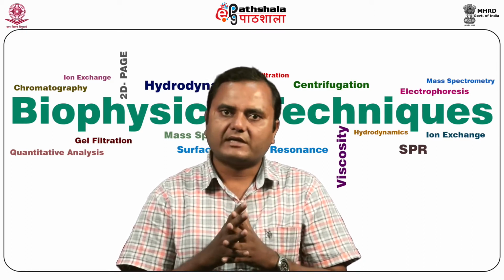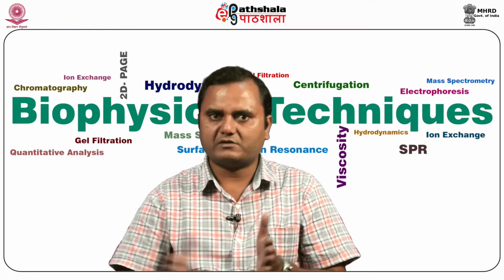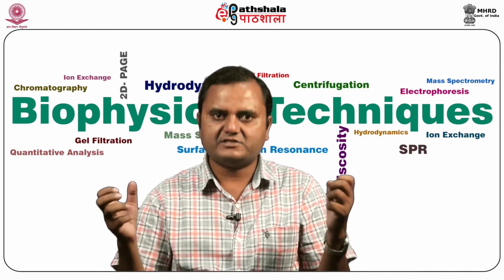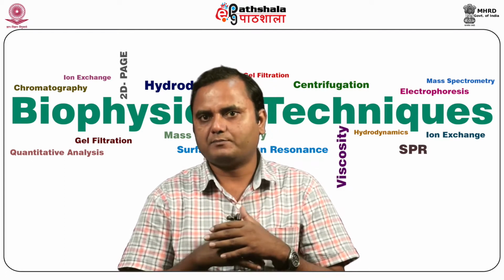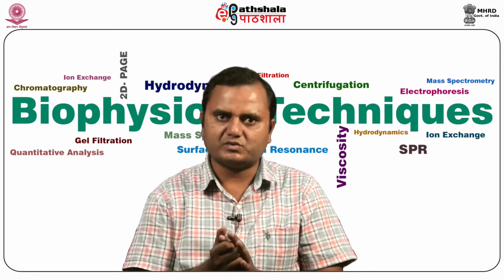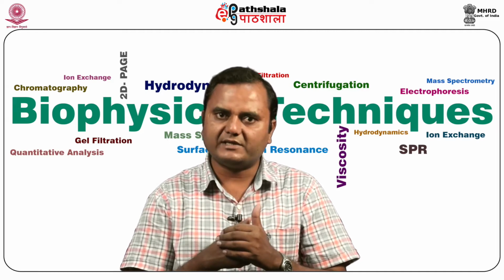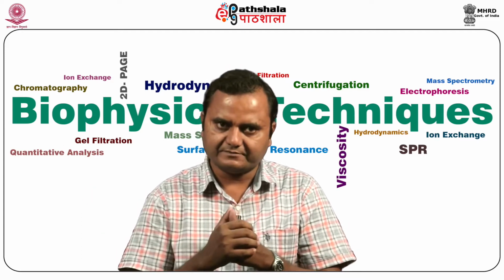It can be used for the calculation of molecular mass, and it is applicable for a large molecular mass range from 100 to 10,000 kilodalton. So it has a very wide range for the calculation of molecular mass, and it also gives you the properties of the molecular mass in solution form. Usually the other techniques used for the calculation of molecular mass are not in the native form, like SDS or mass spectrometry. There are harsh conditions, but here the condition is as good as the native condition.